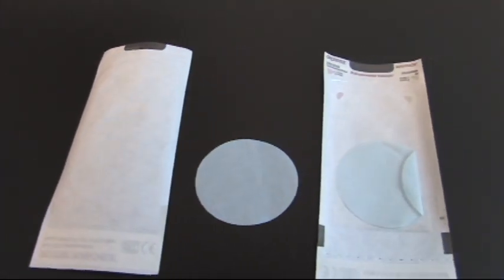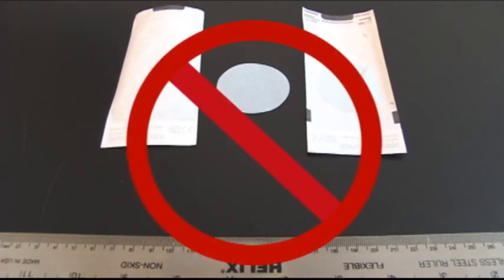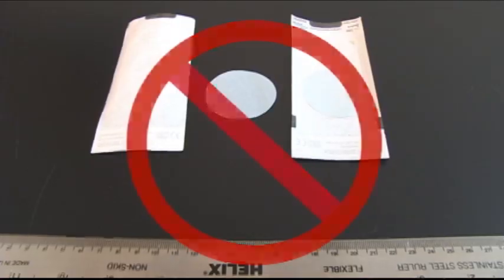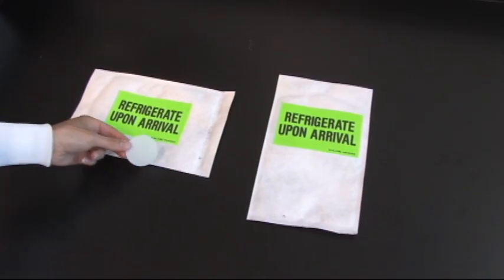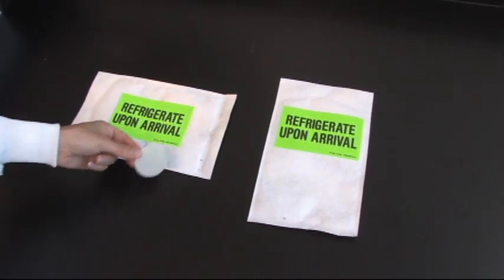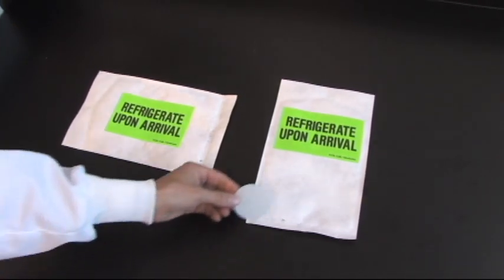Samples smaller than 47 millimeters cannot be tested with this method. Samples with large labels must have an area of at least 47 millimeters of exposed porous material.